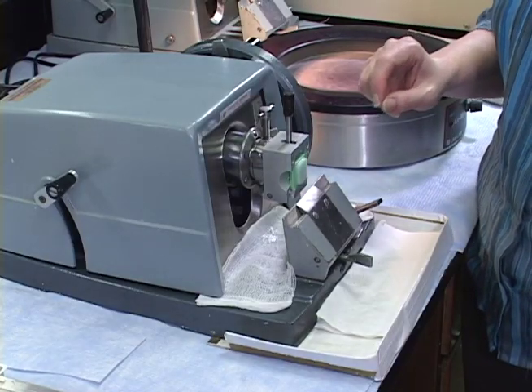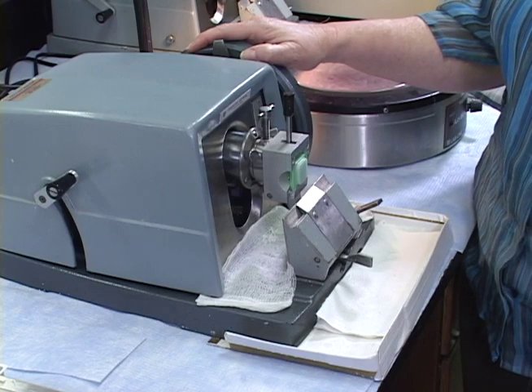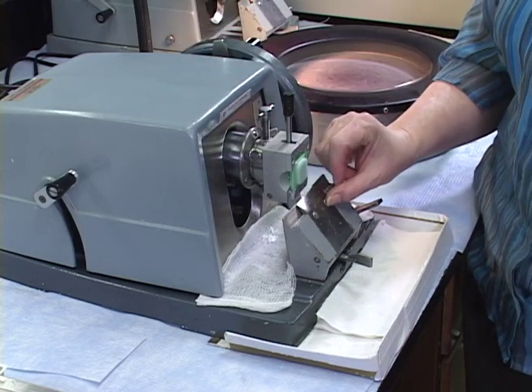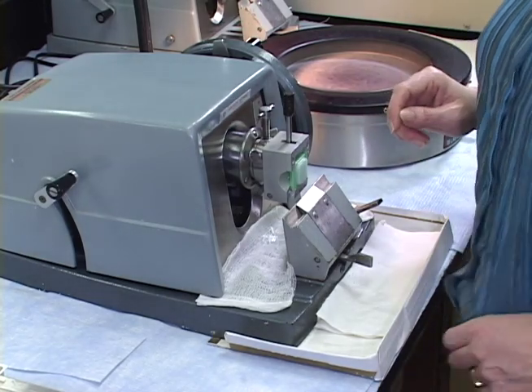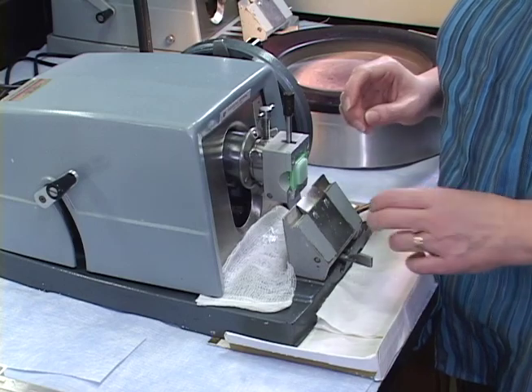There is a danger in getting your finger cut by the blade, and that's why I recommend having this locked. And when you remove specimens, for sure have that locked. If you really are concerned, you can remove the blade between each block. I don't do that, but if you want it to be 100% safety orientated, you could do that.